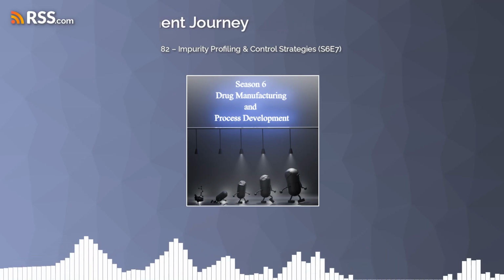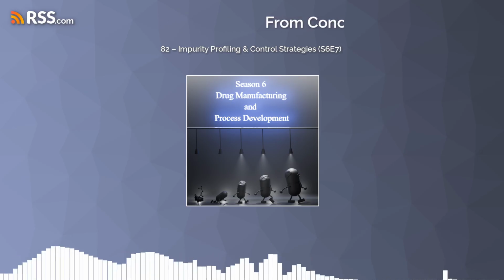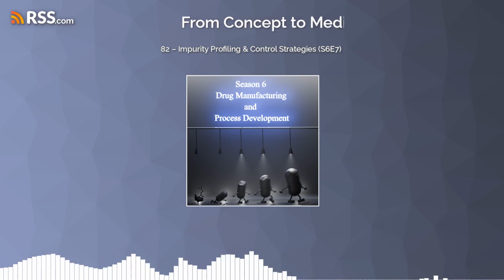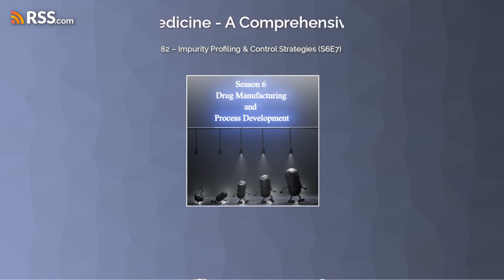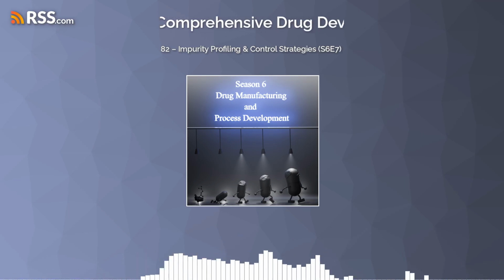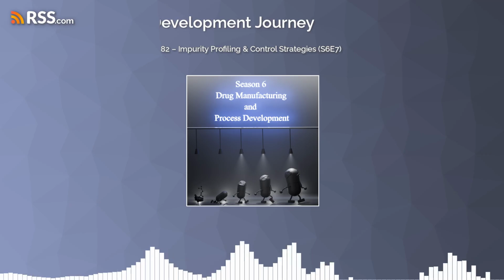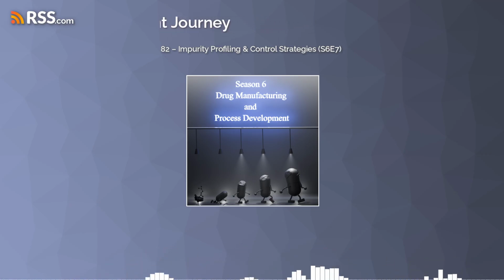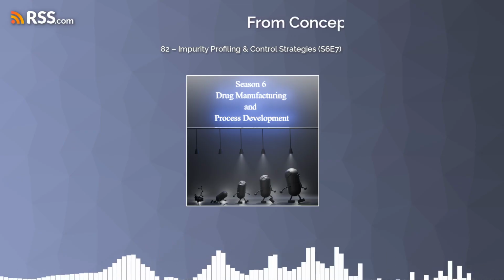And often working hand in hand with NMR, we have mass spectrometry, or MS. I remember reading that together, they're like the dynamic duo for unraveling the mysteries of unknown impurities. They really are. NMR gives you the blueprint, right? And then MS comes in and basically it weighs the pieces of that blueprint. By looking at those weights, we can figure out what an impurity is, even if we've never encountered it before. And when you use high-resolution MS, you get crazy accurate ID.